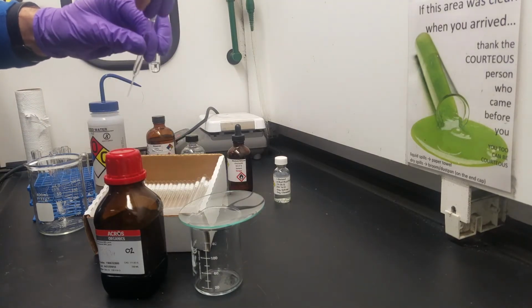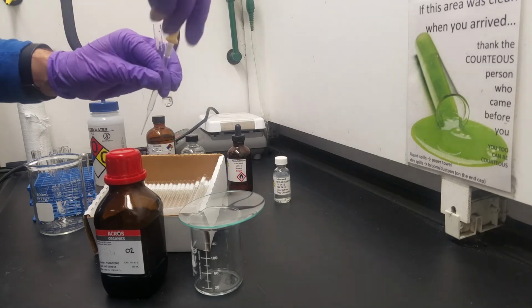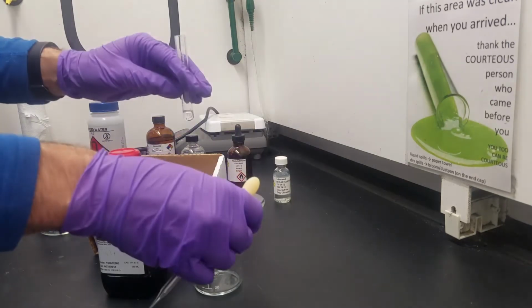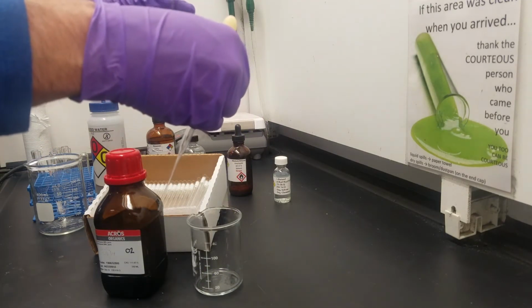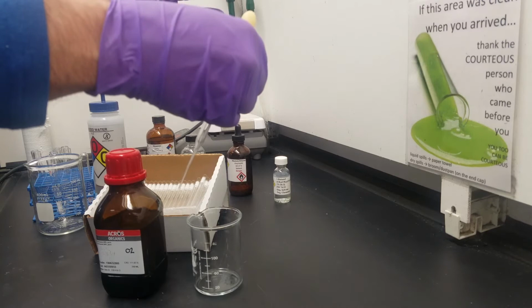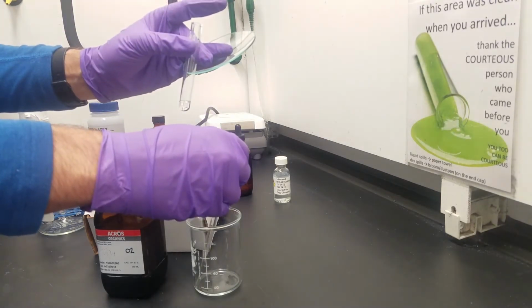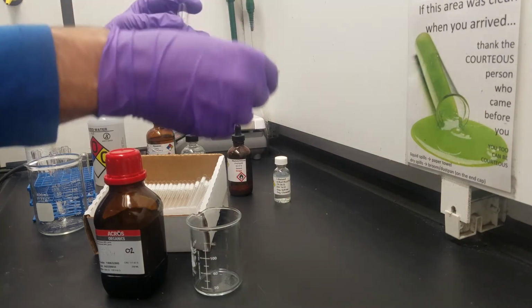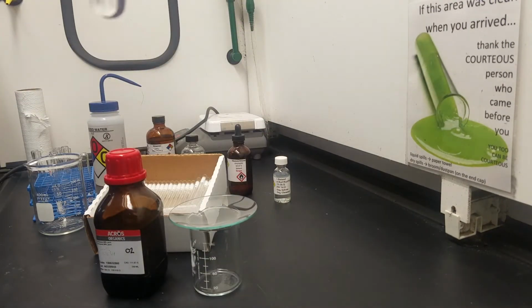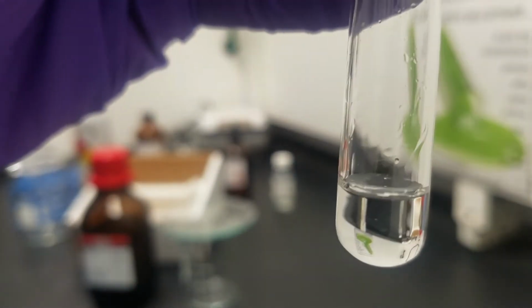This dead space of audio is bothering me somewhat, so again we'll call out, keep our pipette tip aimed down. We will also notice that you see that little pinky missing. That's an artifact again because I need to be able to touch the cell phone to stop the recording. Ideally we have our gloves fully protecting our hands and we don't encounter that potential space for contamination to seep through. Note that we covered all of our containers before going to our actual reaction.